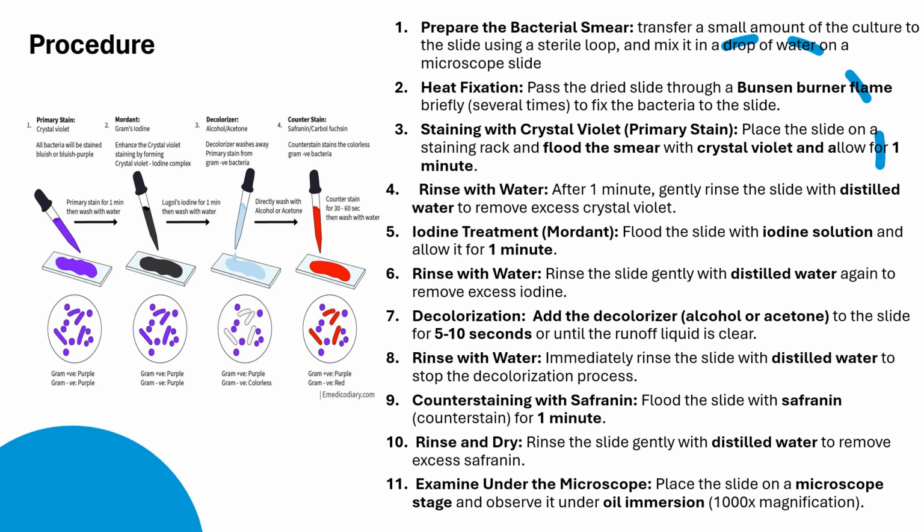Then counterstaining with safranin. Flood the slide with safranin for 1 minute. Rinse and dry. Rinse the slide gently with distilled water to remove the excess safranin. Examine under the microscope. Place the slide on the microscope stage and observe it under oil immersion, that is 1000x magnification.